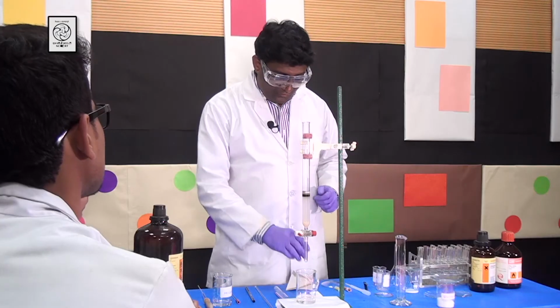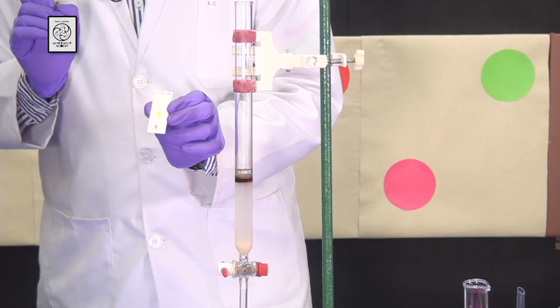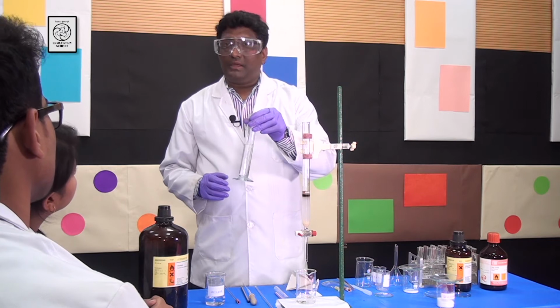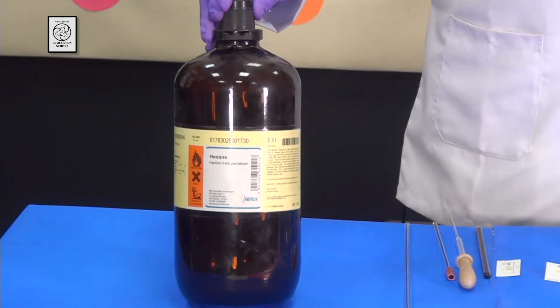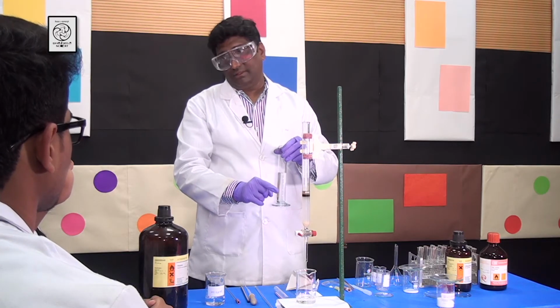So students, from our TLC experiment, we know that the yellow compound and the red compound can be separated with an 80-20 mixture of hexanes and ethyl acetate. You can see I made 50 ml of 80-20 mixture of hexanes and ethyl acetate, and I am going to use this as the mobile phase to elute the compounds in the column.